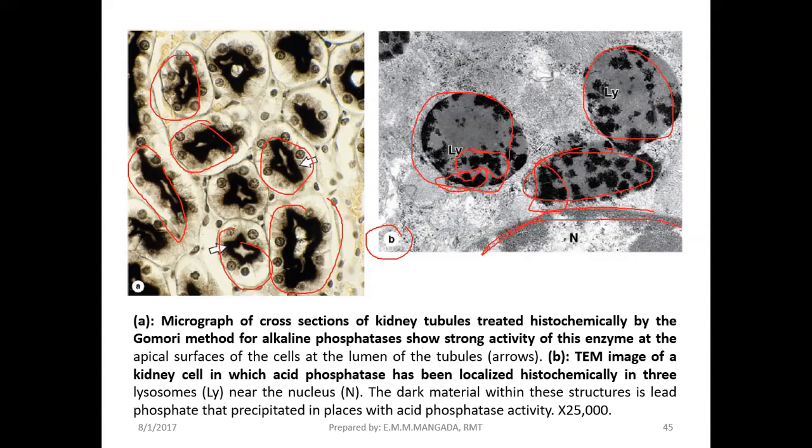Yung product ng enzymatic reaction na kinakatalyze nung enzyme of interest natin. So ito sila. Dito siya nagpe-perform ng kanyang activity. So that's for your enzyme histochemistry.